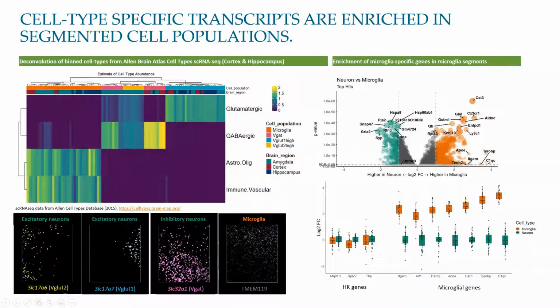And as you can see, microglia-specific markers are expressed by the microglial population that we identified by the GeoMx DSP analysis. Similarly, cells specific to the neurons, again, were found in the neuronal populations that we profiled using the joint workflow, just showcasing that we were very specific and sensitive in identifying these different populations of neurons and glial cells within these specific regions of the brain.